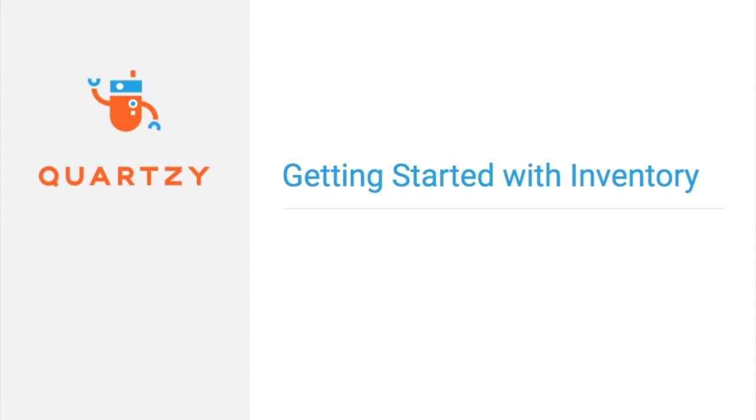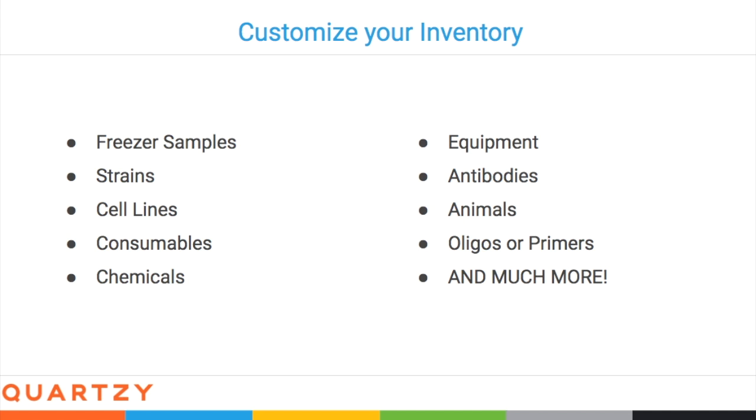Hey guys, this video is going to teach you how to use Quartzy's inventory module, the place where you can keep track of everything in your lab, like freezer samples, chemicals, equipment, and much more.